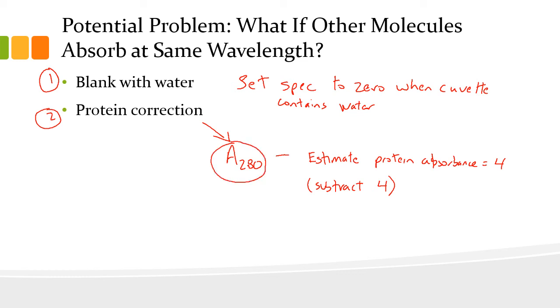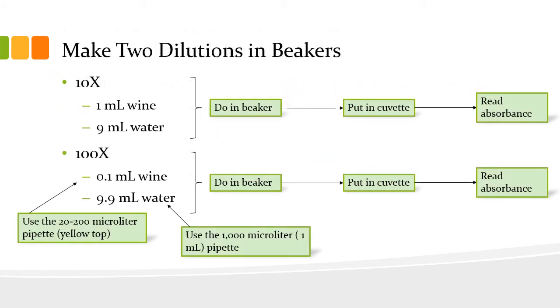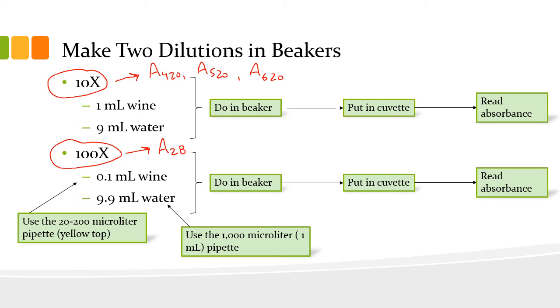Okay, a couple of things we do. We're going to make 2 dilutions. We'll do a 10x dilution and a 100x dilution. The 10x dilution we'll use for the A420, A520, and A620 absorbances. The 100X we will use for the A280 absorbance. So 100X dilution would be 0.1 mils of wine with 9.9 mils of water. So 1 part wine and 99 parts water.